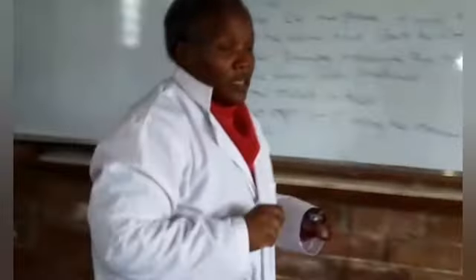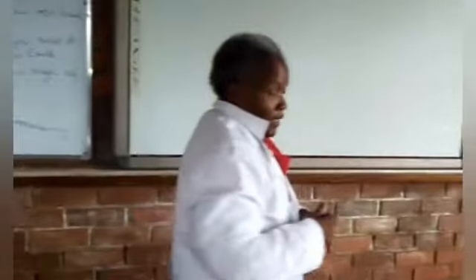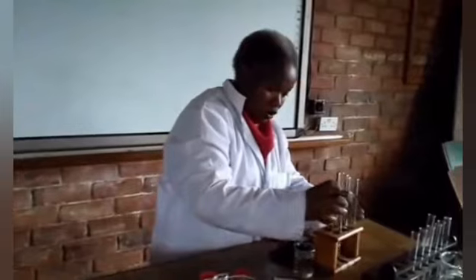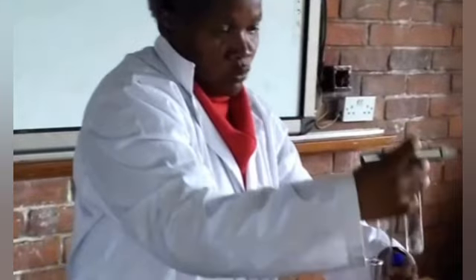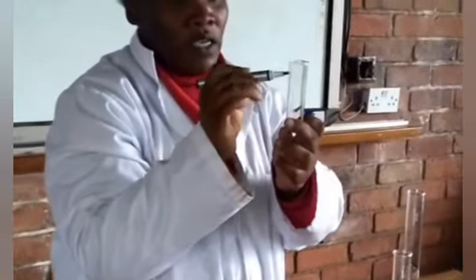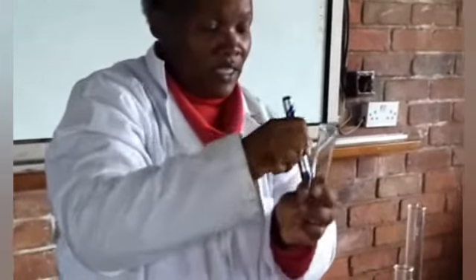So wait for the iron, and as you are waiting for the iron, I can also now load the final one. Go to this other empty one, which is my E, and in my E I'm going to put my magnesium. Okay, Mg, where are you? Okay.